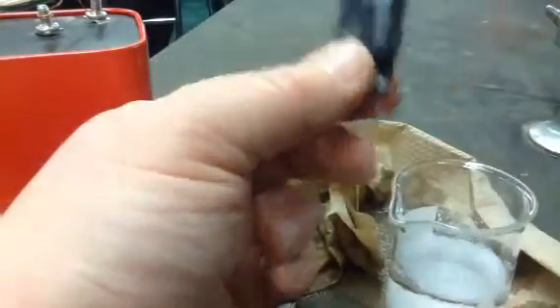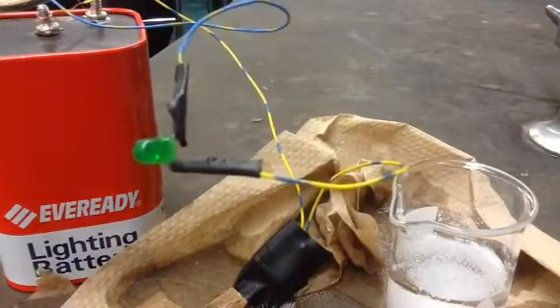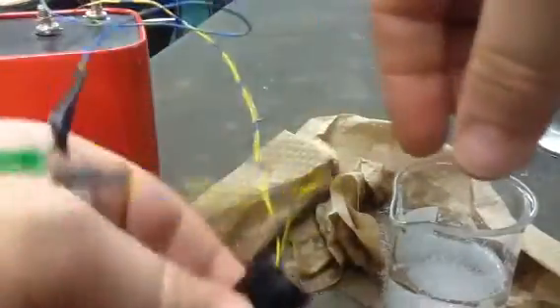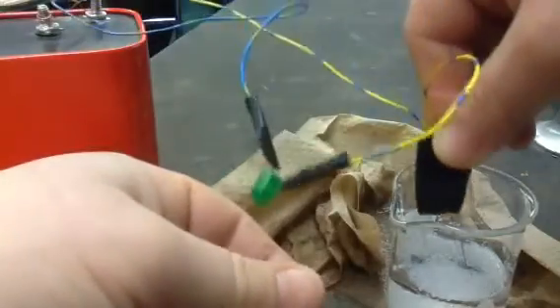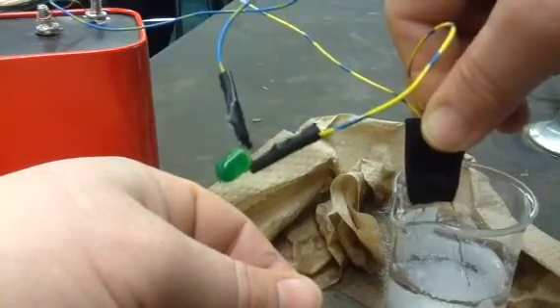And let's do the phenyl salicylate. Now, is this actually a solution, the phenyl salicylate? No, it's not soluble. It's not even a solution. So, you know, testing for conductivity is kind of silly, but we do it anyway, and hey, no surprise there. Nada.